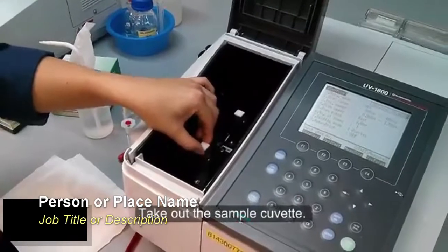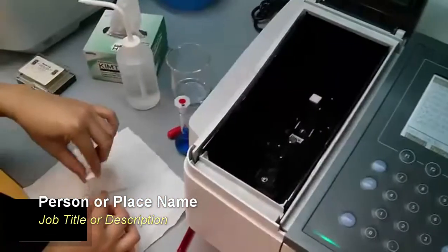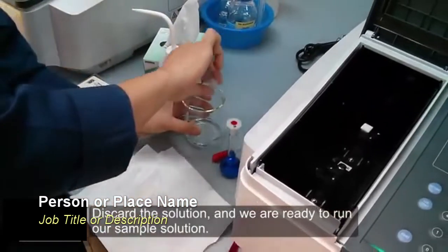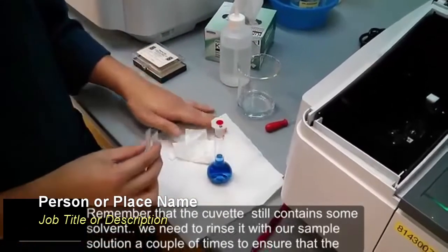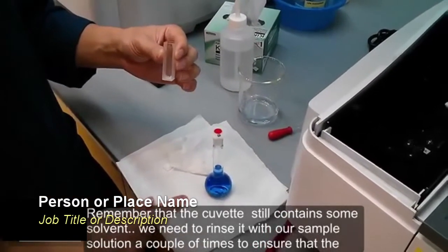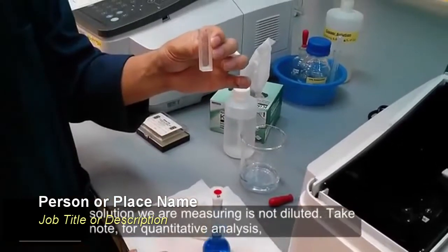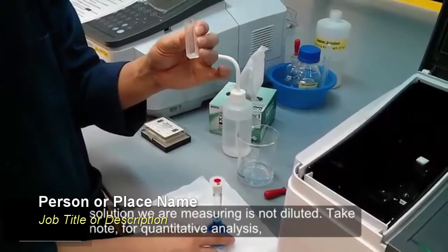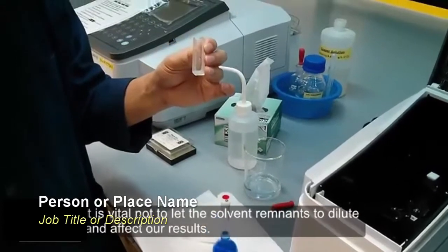Take out the sample cuvette. Discard the solution and we are ready to run our sample solution. Remember that the cuvette still contains some solvent. We need to rinse it again with our sample solution a couple of times to ensure that the solution we are measuring is not diluted. Take note, for quantitative analysis, it is vital not to let solvent remnants dilute and affect our results.